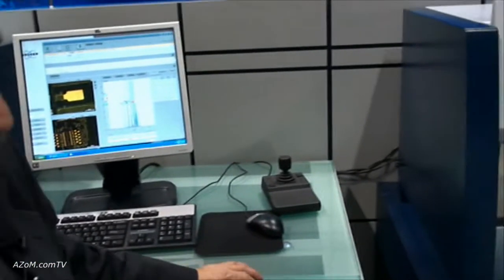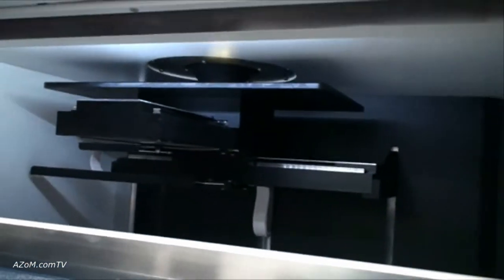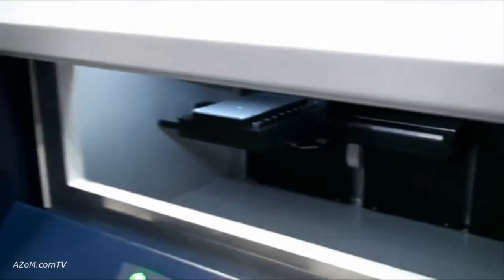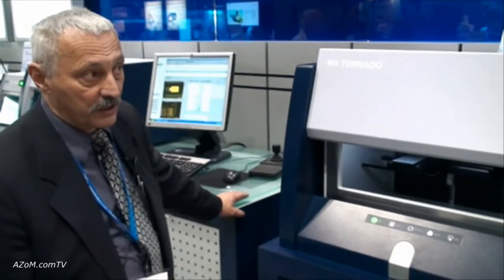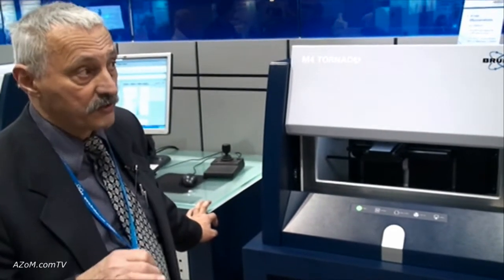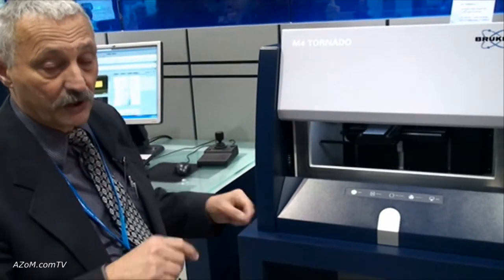The current top instrument in this series is the M4 Tornado. This is a high-level instrument with a large vacuum chamber for samples up to 30 centimeters. We excite with the help of a capillary optic, which concentrates the radiation down to 25 microns. Detection is done with an X-Flash detector, providing high energy resolution and very high count rate capability. This allows very exact elemental analysis as well as coating thickness analysis — not only in one spot. Due to the motorized XYZ stage, it is also possible to perform distribution analysis, for example on a line or on an area, meaning we can make line scans or mapping to get a picture of the element distribution of an inhomogeneous sample.